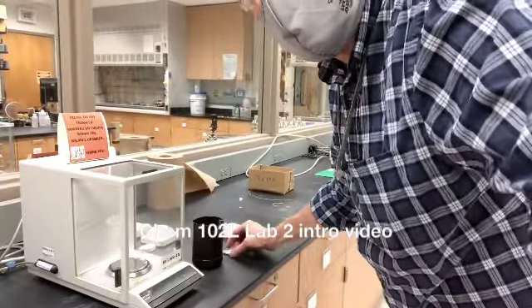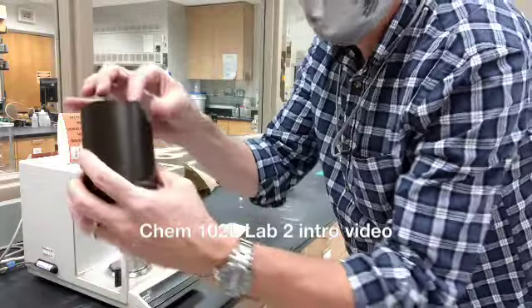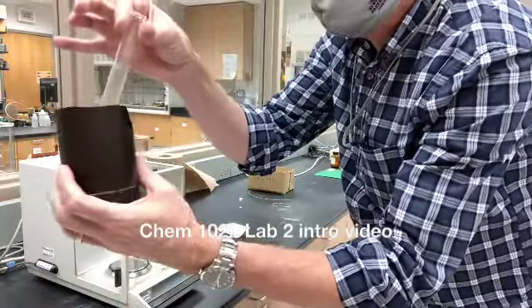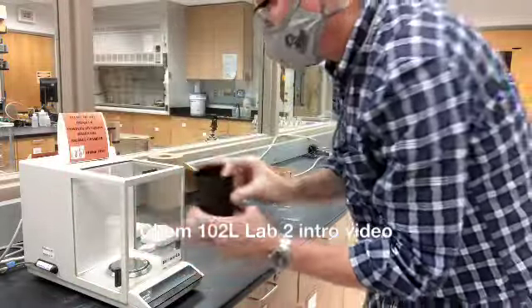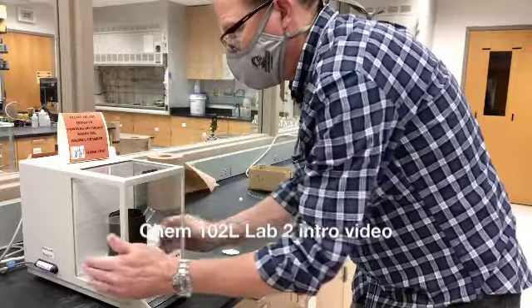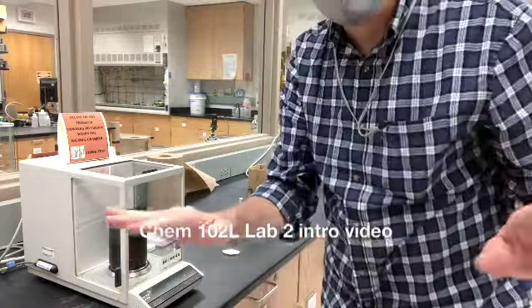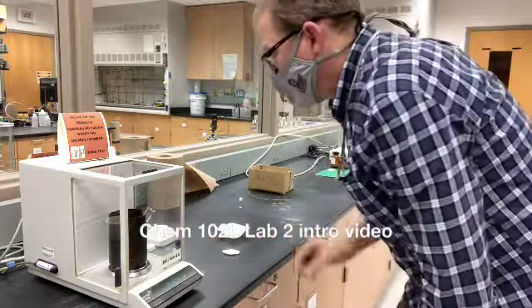So, here we go. We have our test tube with its lauric acid, stir bar, and its support. That goes on the balance. Okay, I'm going to hit the bar, and that's going to zero that out. So that's now tared.